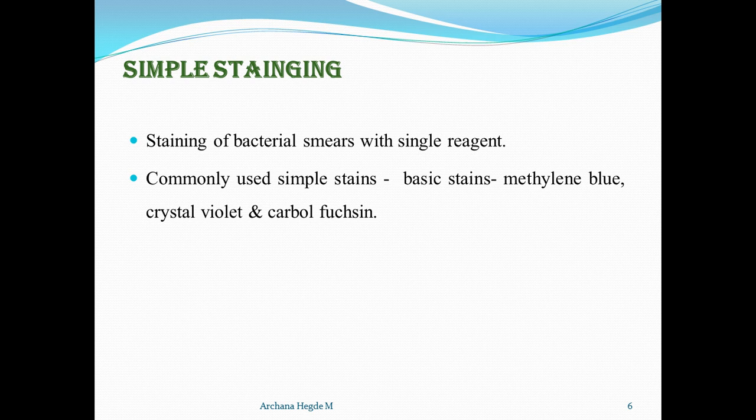Simple staining is a technique used on bacterial smears with a single reagent, nothing but a single stain or single color. It may be a positive stain or a negative stain, but only one stain is used. Commonly used simple stains are basic stains: methylene blue, crystal violet and carbol fuchsin. In this also, stains are divided into basic and acidic; some are basic and some are acidic in nature.